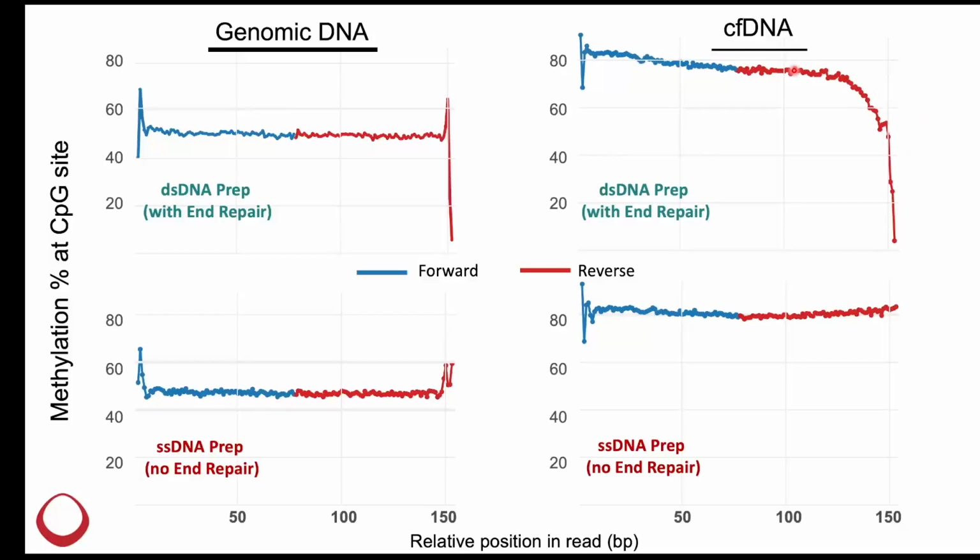When there is a terminal overhang or recessed fragment in cell-free DNA, it's mostly in the range of 10 to 30 base pairs of overhang, but some molecules can be longer. And whether this is an overhang or a nick in the cell-free DNA is important biologically speaking, but for the process of library prep, it essentially means the same thing.